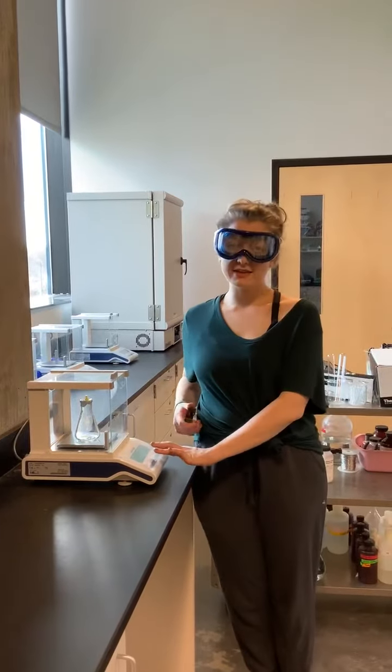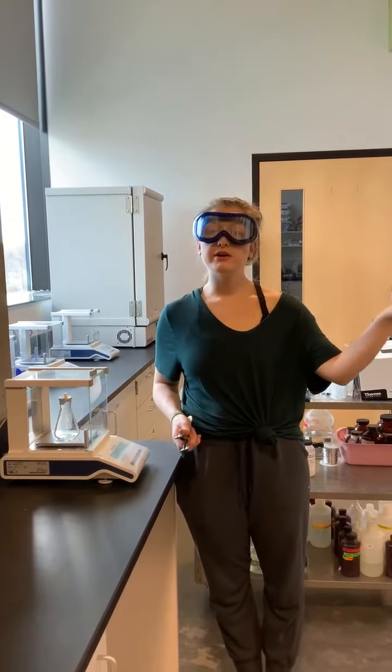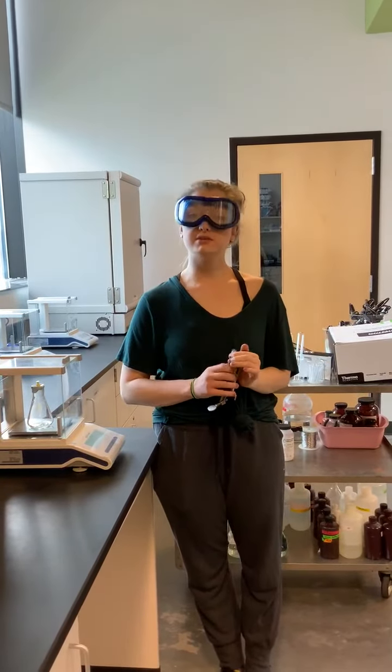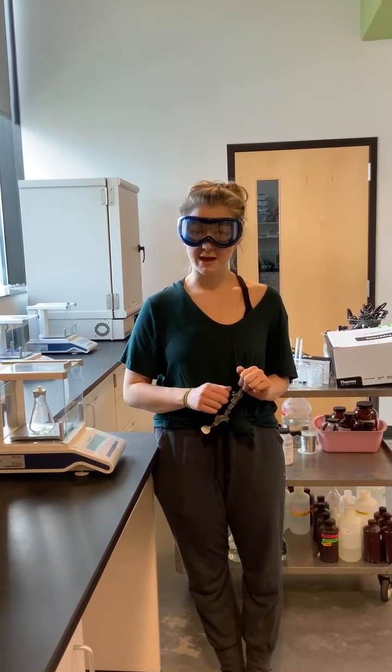We will then take this reading of the mass of the volatile liquid, and we will take the initial mass. The difference between the two is going to be the mass of the volatile liquid — that is what your data means when you are given your data for this lab.